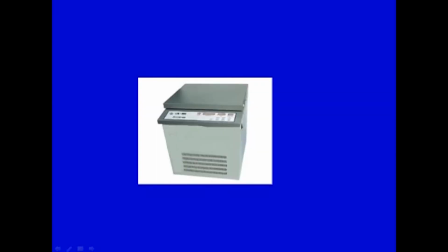A lot of other things could be worked upon here for certain applications. This is a typical high capacity refrigerated centrifuge, as you can see, and it can carry 4 to 6 liters of material. These could vary in capacity, and various types are available in this range.